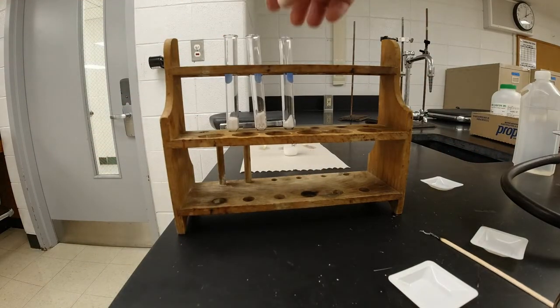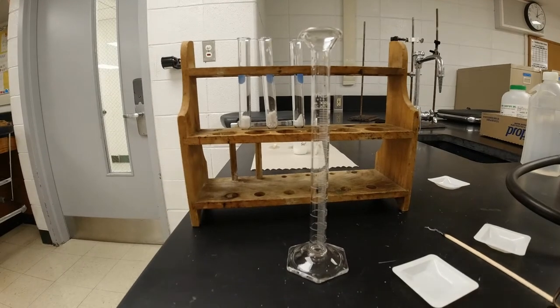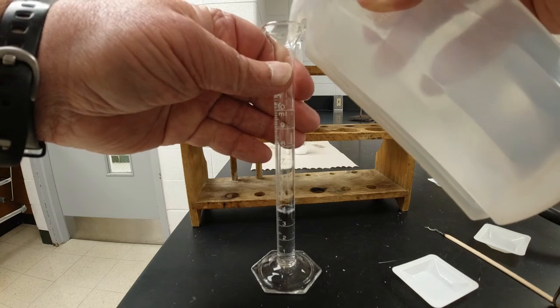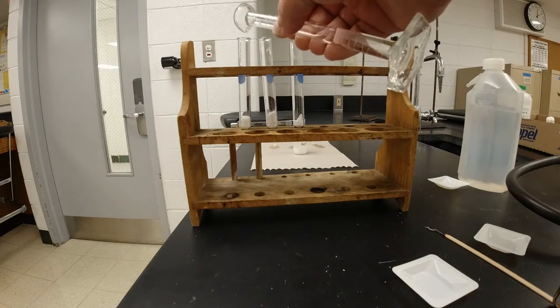All right. So in each one of these test tubes now, I'm going to add, it says they add 5 milliliters of distilled water. So there's my graduated cylinder again. And we're going to add 5 milliliters of water. All right, let's pour that in.